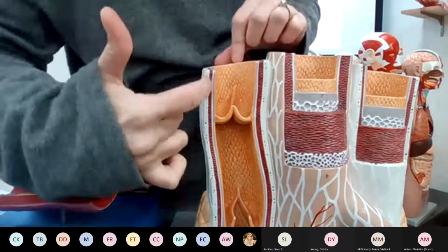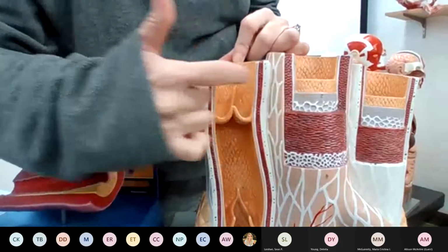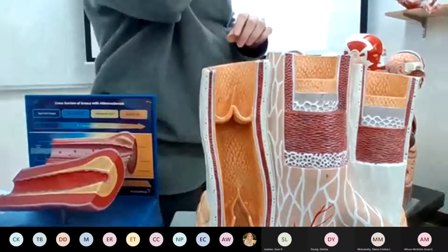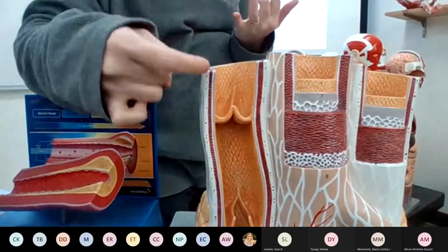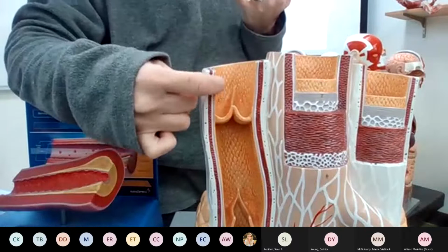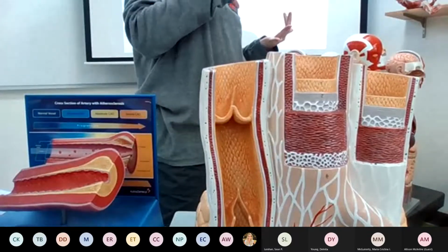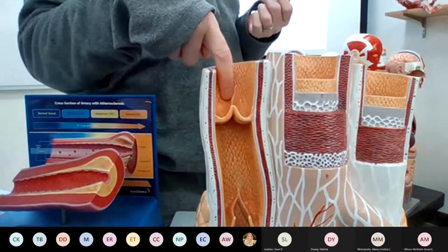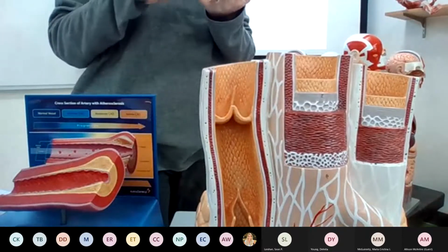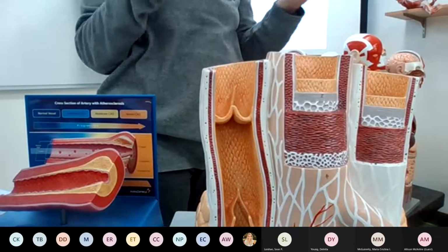Okay, so right behind, and it should be this little gray, all right, that should be your areolar connective tissue. So that's where you're going to find the capillaries that are going to feed the endothelial cells some of their nutrients like oxygen and glucose and amino acids, because they can't get it from the blood. Okay, that is where you'll find some collagen and elastin material.